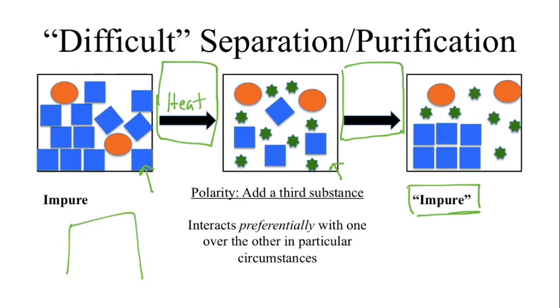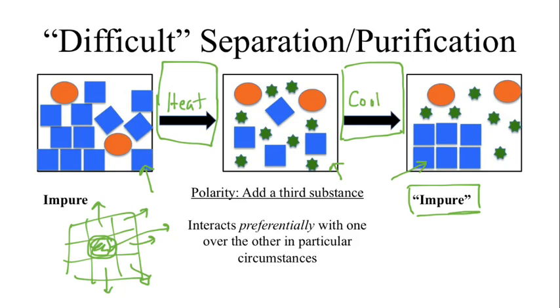Now if I had that impurity in there, remember back to our initial issue, my solvent's been able to break everything apart in conjunction with the heat. So now I can get that impurity out. Okay, but my goal is I still need crystals. Okay, well, the hope, or my choice, is that I'm going to then cool everything down.